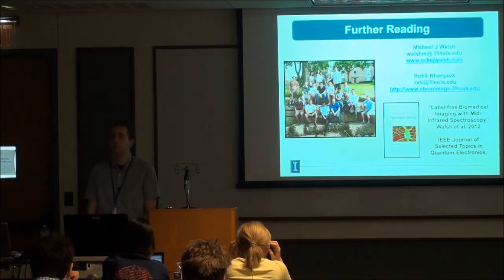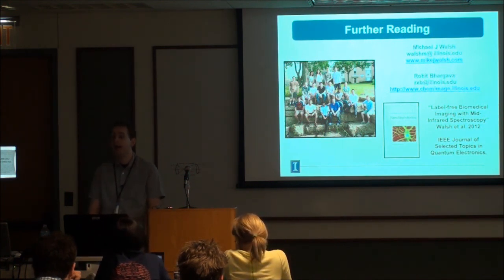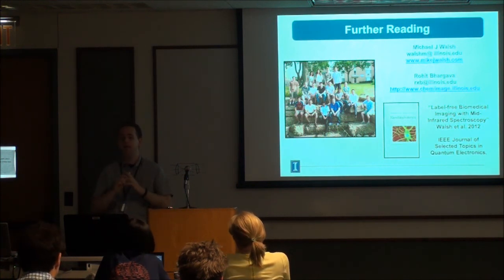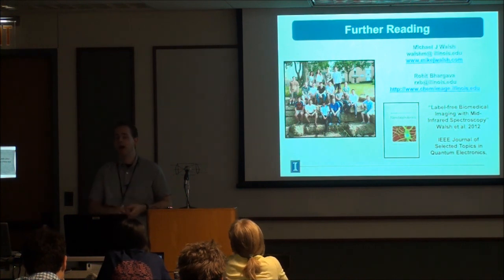It's when you select your region of the spectrum and then use it in your model, how do you do that? There's a few ways of doing this. In general, we just data mine, so we'll just look for what looks promising. Even if we pick badly, when we do the sorting steps, you run the classifier, derive an area under the curve, and then you kick out any metrics which are bad.